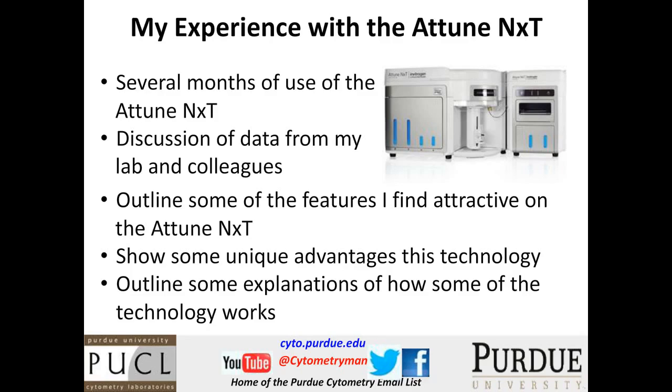And I'll discuss some of the unique advantages of the technology, because in every instrument there's usually something that is really quite unique, and there's a couple of things on the Attune that I'd like to share with you. And I'll try to expand on some of those issues because I have discussed this with a number of people, and I've found that some people don't quite understand exactly how the technology works. So my goal will be to try to outline that in a fairly easy to understand way.